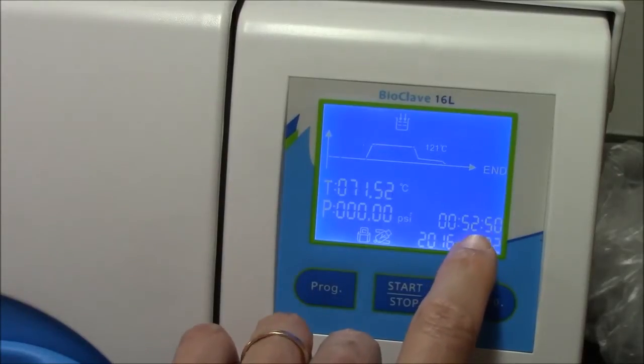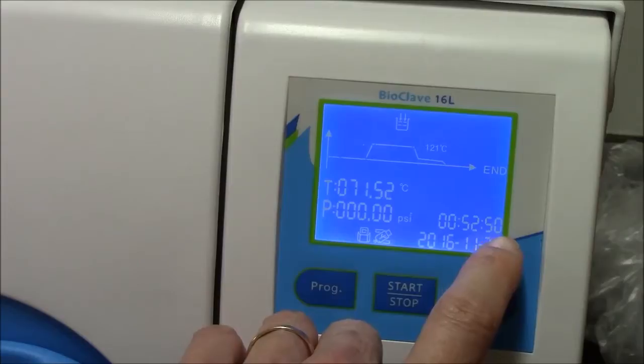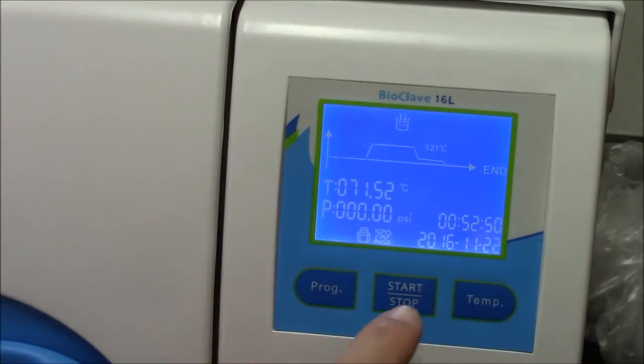It looks like the total sterilization run was 52 minutes and 50 seconds. It's still quite warm so I'll keep the door closed.